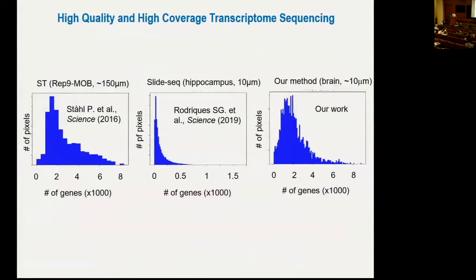So I was very excited about this data quality, which really enables us, on the following slides, to visualize individual genes rather than using extremely sophisticated informatics to identify gene sets just to visualize the different cell types. We can actually interrogate every single gene across the entire tissue map.